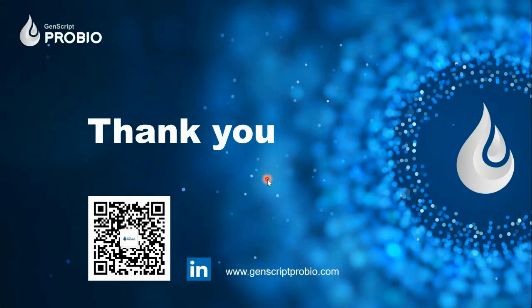Thank you, Dr. Ali. The next question: what's the main difference between adherent and suspension processes? Yes, as I mentioned, we get a lot of these questions. The adherent system requires serum, bovine serum. In suspension, there is no BSA when you're using it for LVV production. The passaging for the suspension process is also much easier compared to adherent.